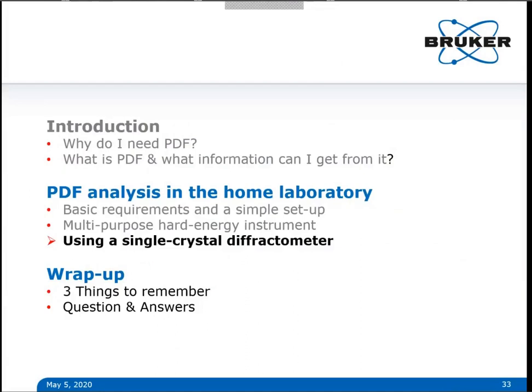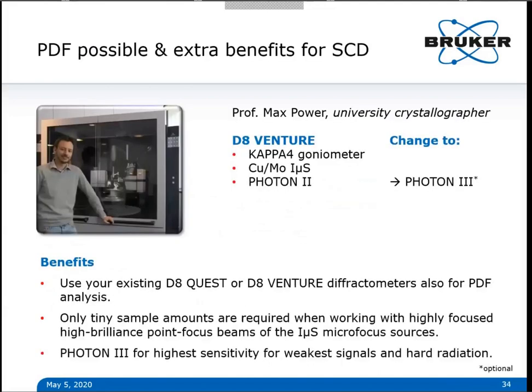Well, so much for powder diffractometers. So shall we take a look at what we can do with a single crystal instrument? Absolutely. Many single crystal instruments have not just one, but two sources. And one of them is already molybdenum. So everything you need to do PDF is already there.